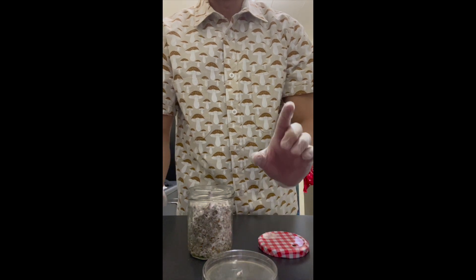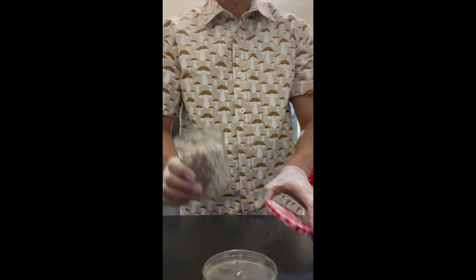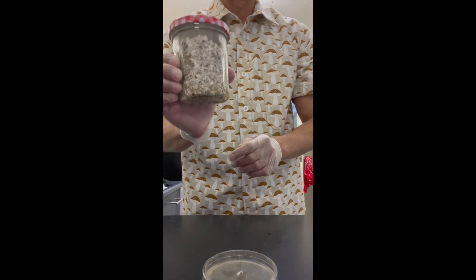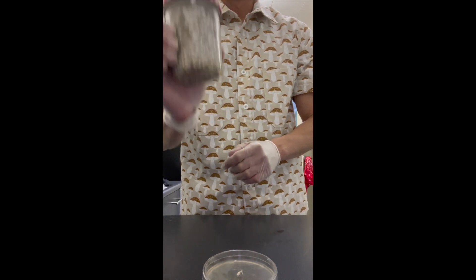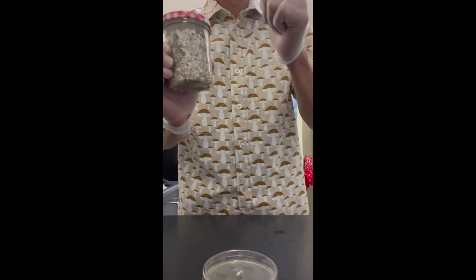I would tip it and show you guys what it looks like, but I don't want the grain to roll around. So that's actually how you save a contaminated jar and transfer whatever mushroom you're growing onto agar. Hope this video helps you guys out. I was supposed to post a picture of how the plate looks after it's grown out. Take care guys, be kind, be nice.